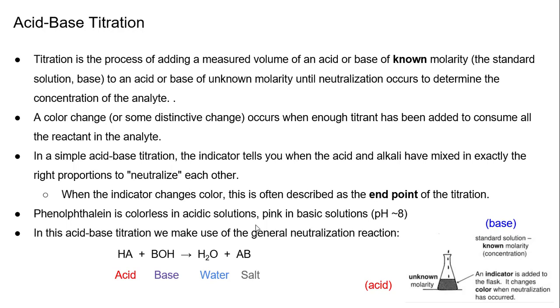If you look down at the bottom, this is a general equation. You have an acid and you have a base. And when they are neutralized, you have water and a salt. That's why this is a neutralization reaction. When the indicator changes color, this is often described as the endpoint. When you reach the endpoint, when you reach the faint pink, your titration stops, and you will record the volume that you used with your known molarity.